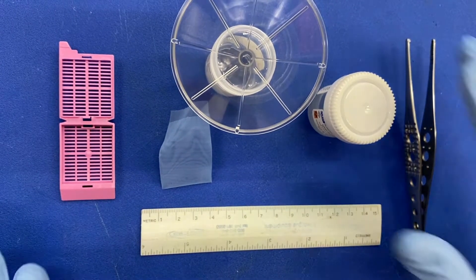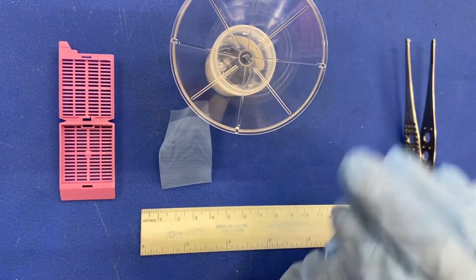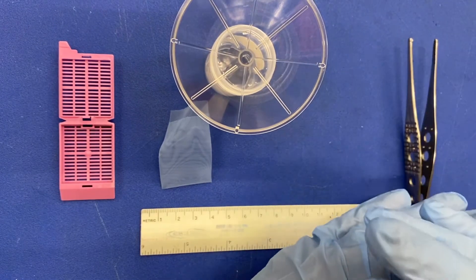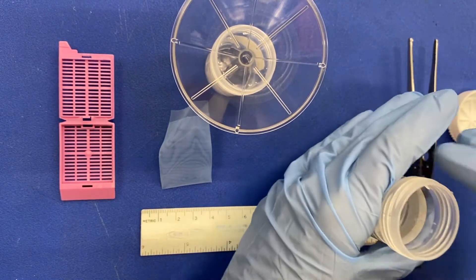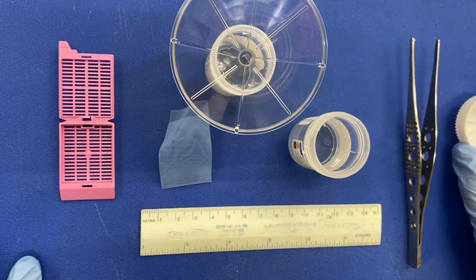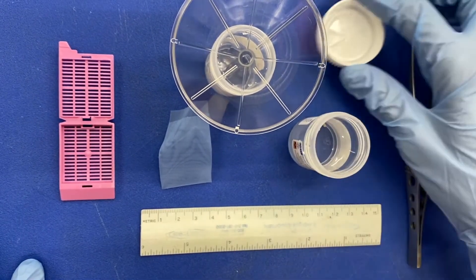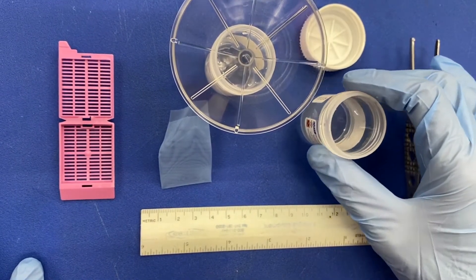First, open the specimen container. Check the lid of the container for any adherent tissue that may be present there. Look inside the container and identify the specimen.